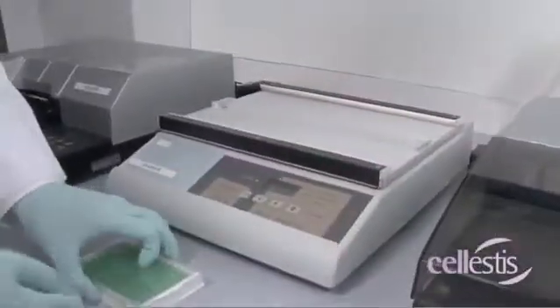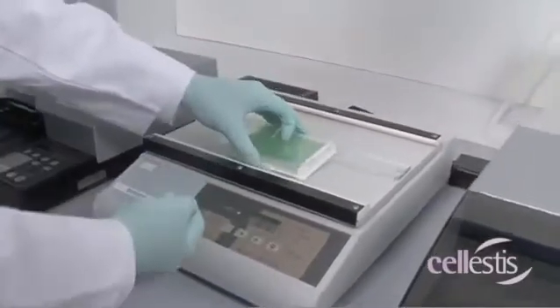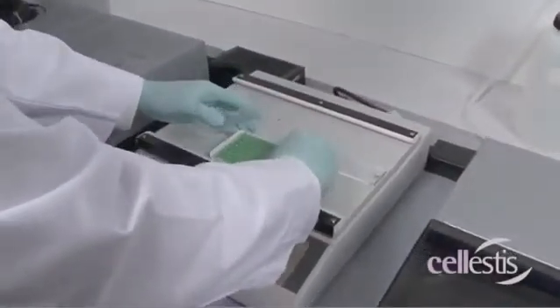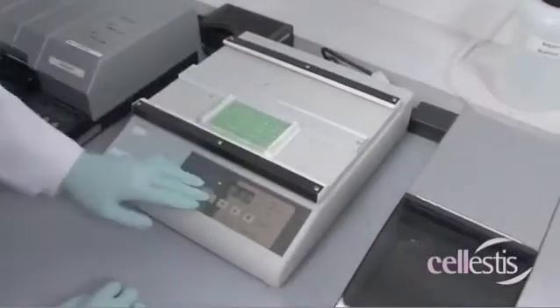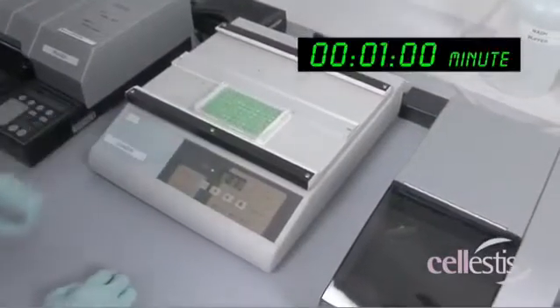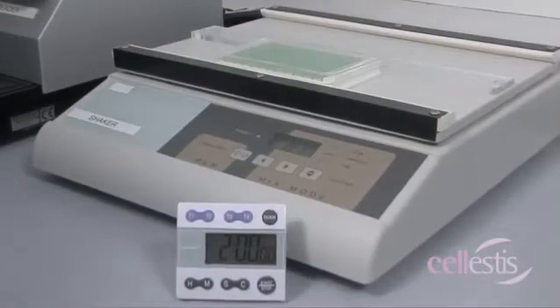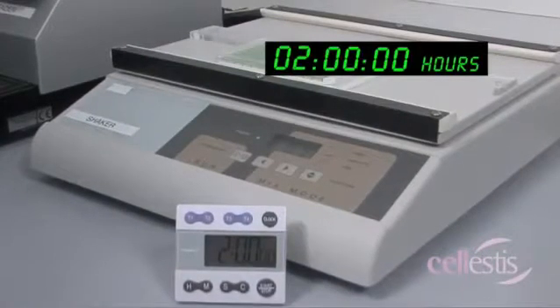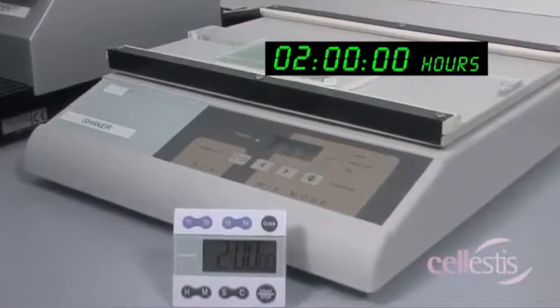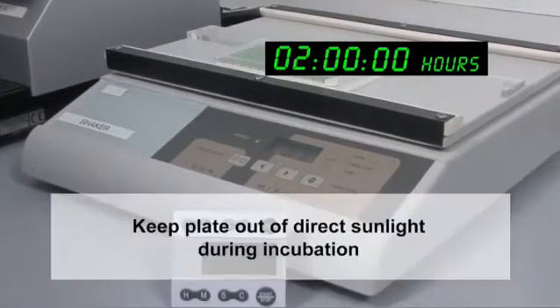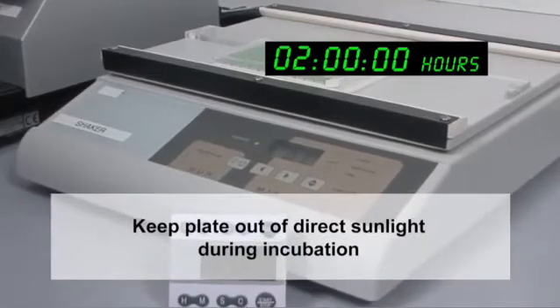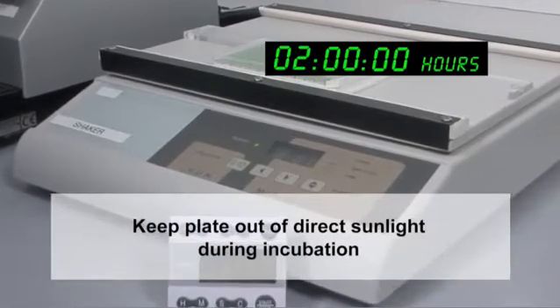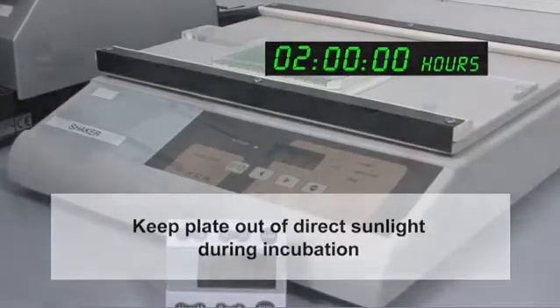Replace the ELISA plate lid and mix thoroughly on the microplate shaker for one minute, ensuring that the samples do not spill. Incubate at room temperature for two hours. The plate should not be exposed to direct sunlight during incubation.